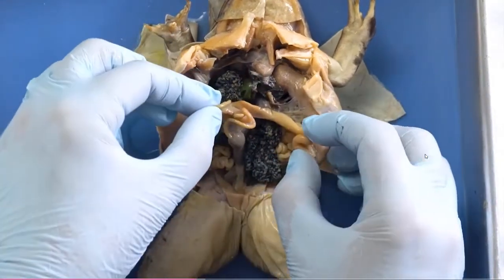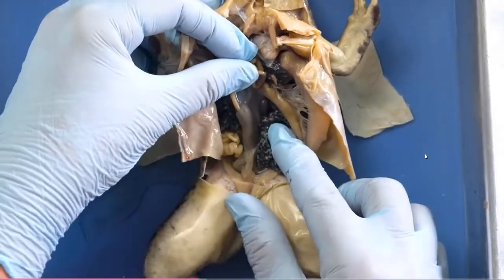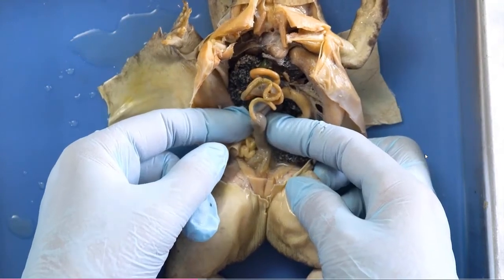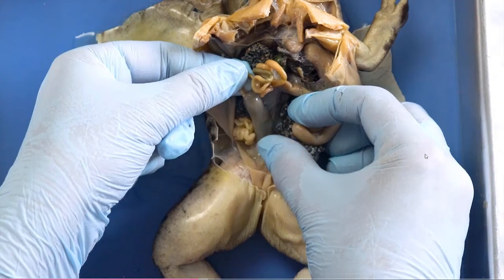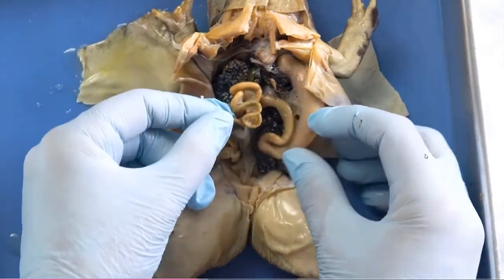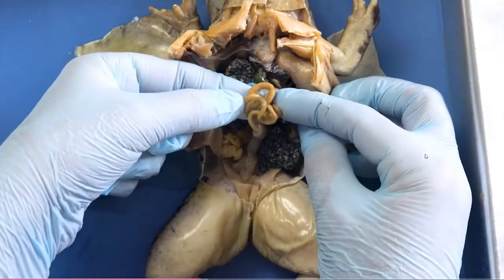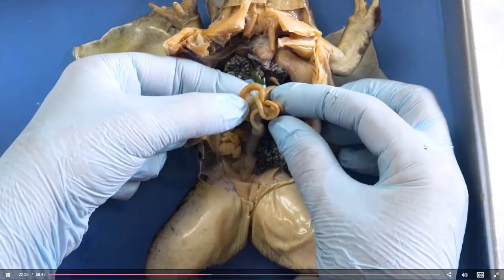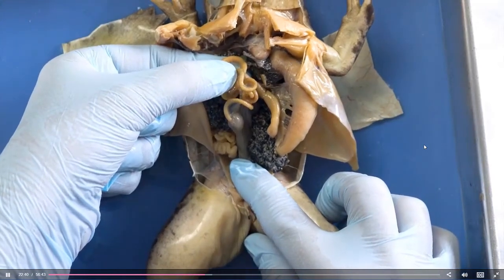I'm going to follow that small intestine down to this spot in the frog where it appears to change in both color and size. This would be the large intestine leading to the cloaca. I would be asking my students why they think that this version of the small intestine is longer, more coiled than this portion of the large intestine.